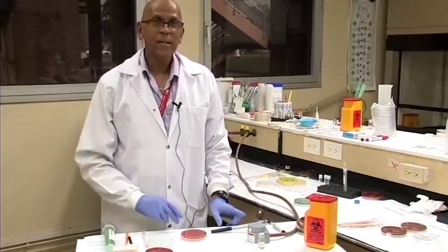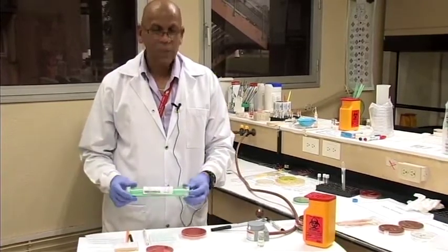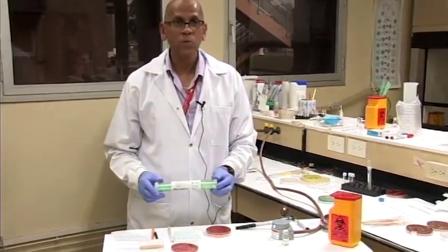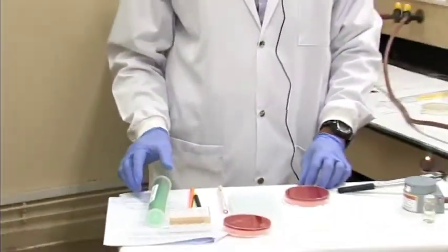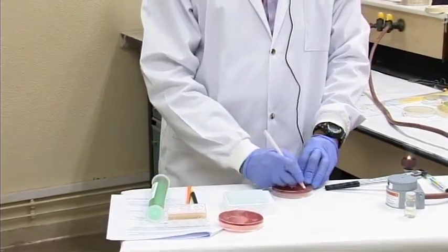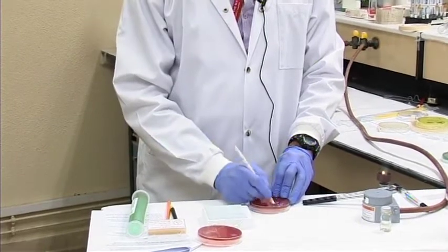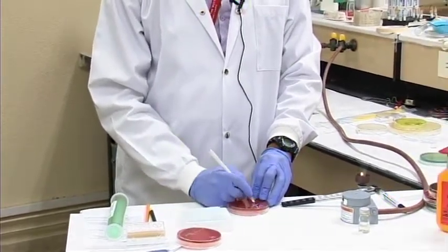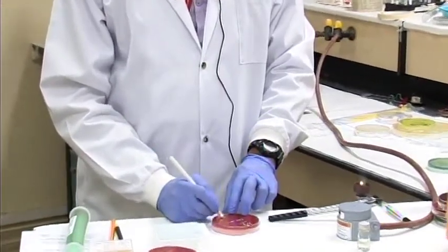Sometimes if you don't have access to a Bunsen burner in a lab, you will have disposable loops where you don't have to flame and cool. These disposable loops are sterile, and I'll show you how to streak a plate using one. Again, we'll take an agar plate and label it with the type of sample, like for example a throat swab, our specimen number, and our date.